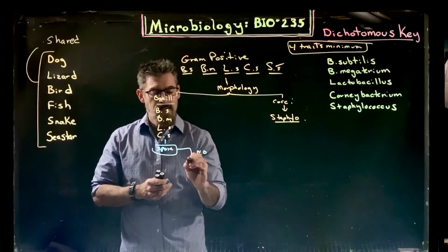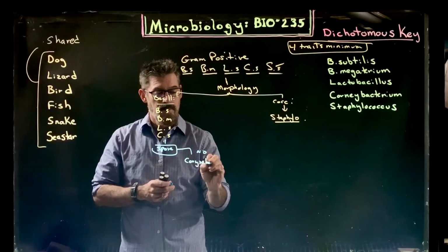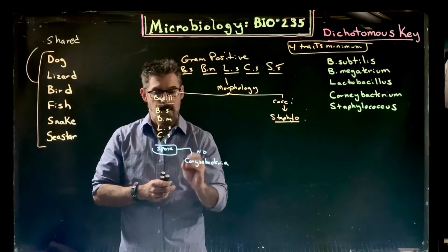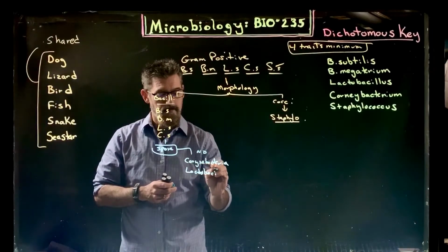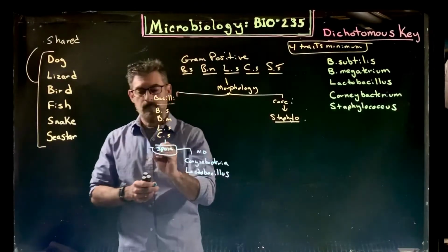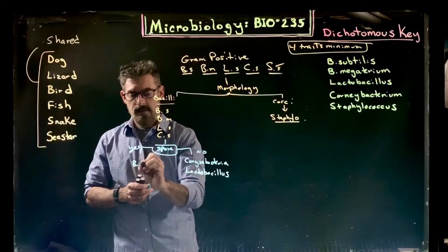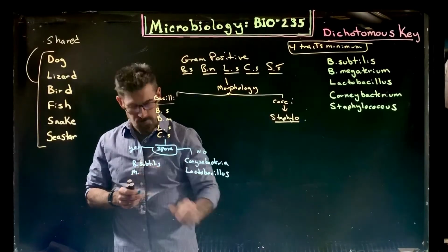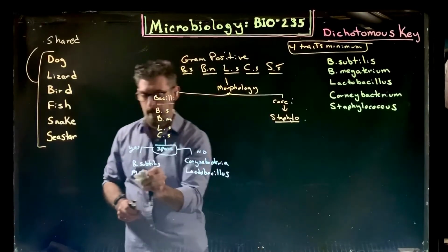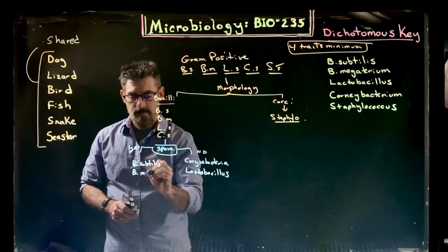No, and that's the corynebacteria and the lactobacillus. Whereas yes, endospore formation from Bacillus subtilis and Bacillus megaterium.